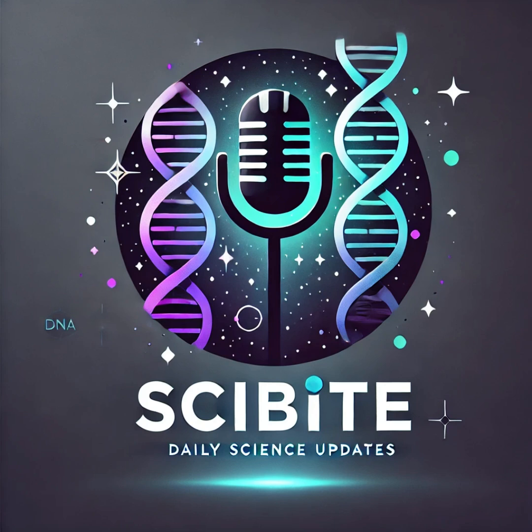That's a great point. And what's even more remarkable is that XLDOT is a non-destructive technique. Unlike some other imaging methods, it doesn't damage the material being studied. So researchers can observe changes in the material structure in real time, like during a chemical reaction or as a battery charges. Exactly. Imagine the insights we can gain from actually seeing how a material's structure changes under different conditions. It's like having a window into the dynamic processes happening at the nanoscale. Now, that is truly groundbreaking.